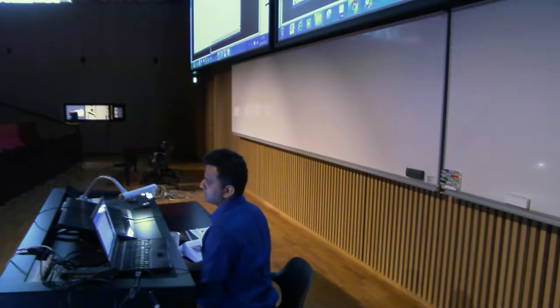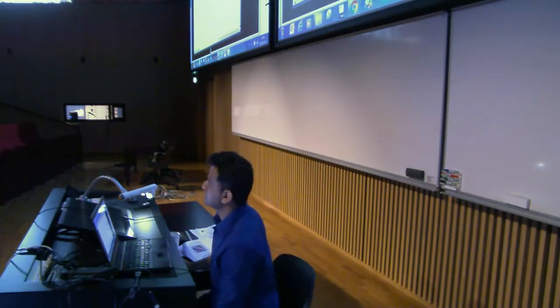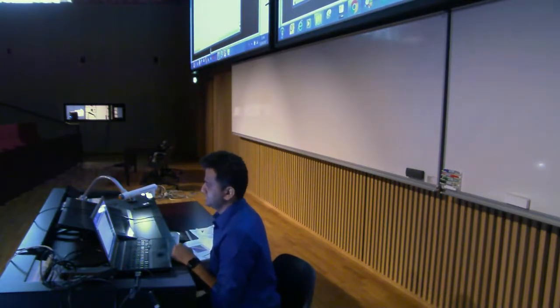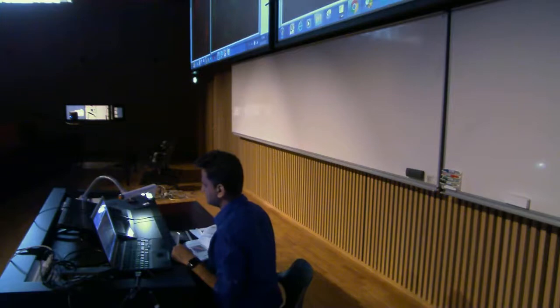Okay, so I have covered the entire co-localization topic and all the issues related to it: how to interpret the Manders M1 and M2, how to do thresholding, how to decide. Because if you do not specify what your background pixels are, then everything will be co-localized. So one needs to know what is foreground and what is background, and then you co-localize. So it's all about that. It's all co-localization.